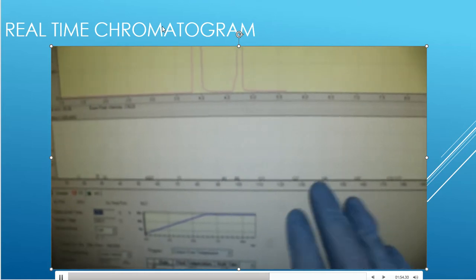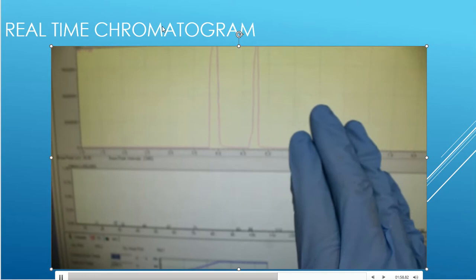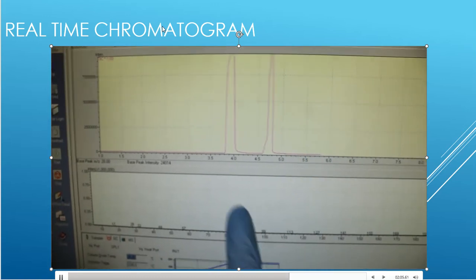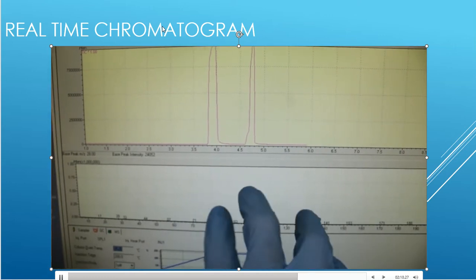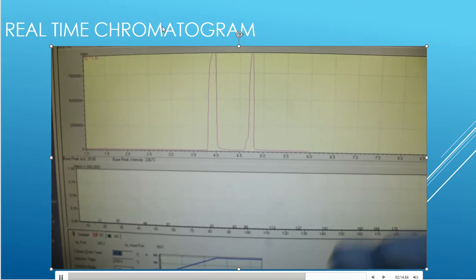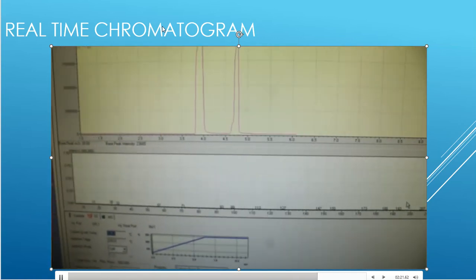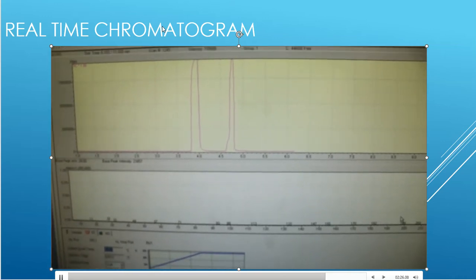On the computer screen, this here at the bottom is the mass spec. So this is what we would call the chromatogram, which is where all the separation takes place. It gives me an idea of what's in my sample. And then down here will eventually be the mass spec screen that I will begin looking at, that I will begin analyzing the mass spectra, and that I will be kind of doing a database search with. All right, so that's a little bit of the view that I'm seeing as a user for a mass spectrometer system in today's analytical laboratory type of environment.